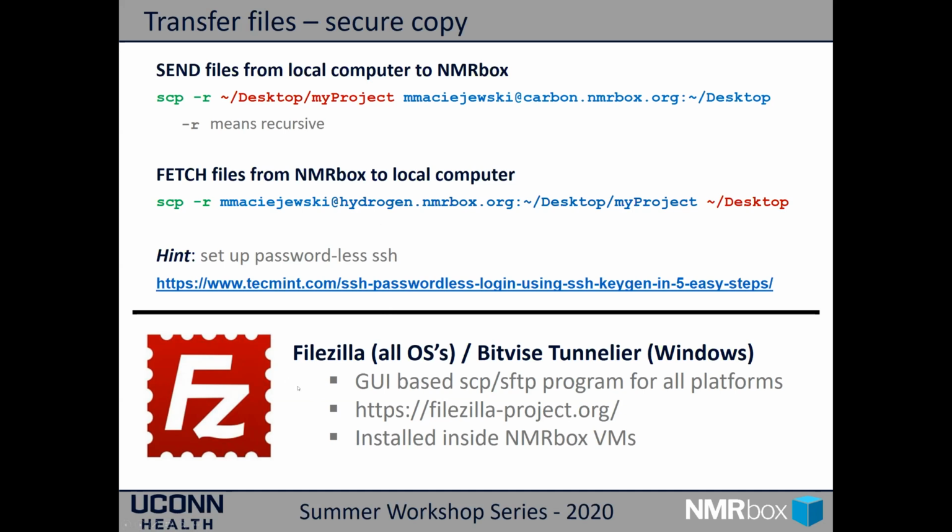There are also some GUI-based tools. FileZilla is one of them, which gives you a graphical interface for doing file transfers. I'm very partial to a program called Bitvise Tunnelier. That's a Windows-based program. It's a really nice program because you can use it for graphical drag and drop transfer of files, but you can also do SSH connections through Bitvise Tunnelier as well.